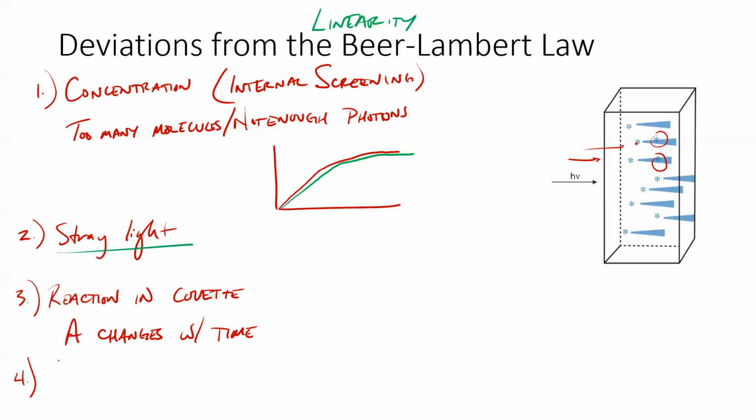The last one to talk about is, as we increase concentration, we could change the refractive index. We talked at the beginning of chapter 3 about refractive indices.